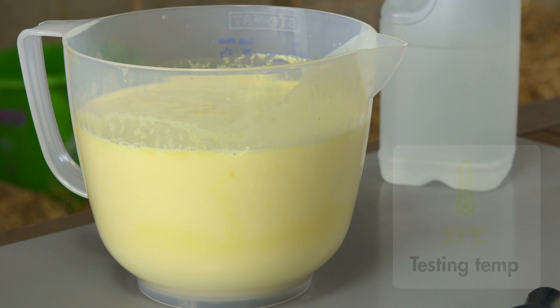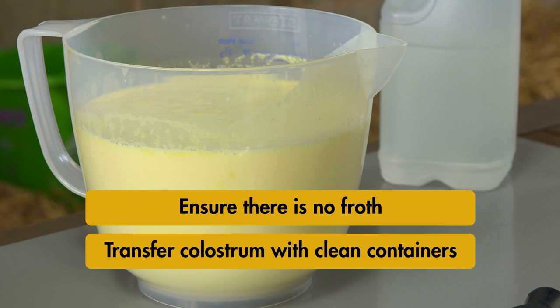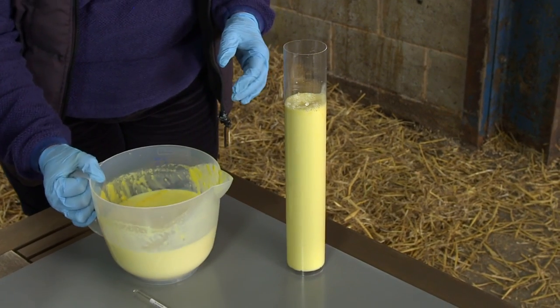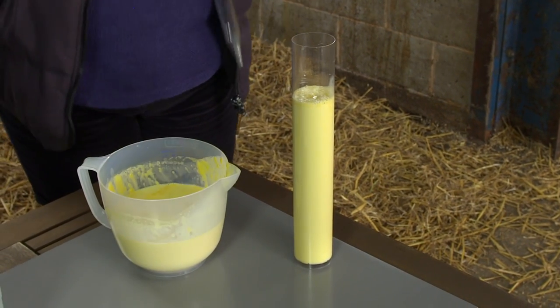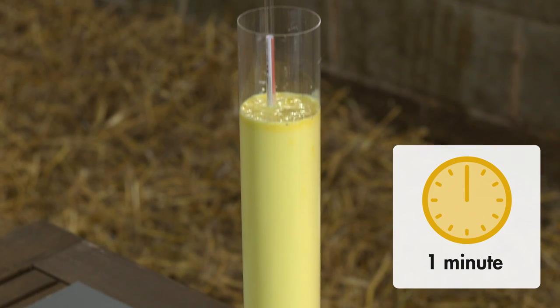It's also important to make sure there is no froth on top of the colostrum. The colostrum should have been collected into a clean bucket and then a sample taken with an equally clean jug so that you don't introduce bacteria. The colostrum from the jug should then be transferred into the measuring cylinder that should have been provided with the colostrometer. The device should be floated in the colostrum for 1 minute.